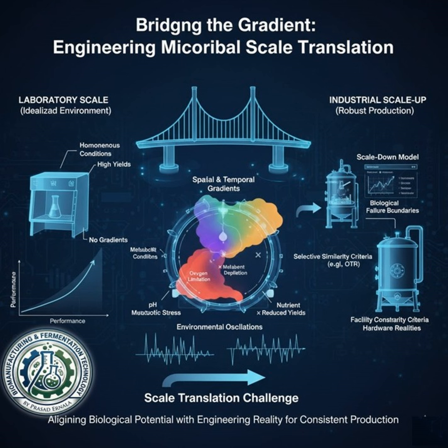And that cycling through these hypoxic, these low oxygen zones, forces it into that inefficient state. It starts pumping out acetate. Yeah, the business impact: a 20 to 30% cut in enzyme yields. If that's a multi-million-dollar product, I mean, that's just catastrophic. It shows why you have to treat mixing and gradients as primary biological factors.